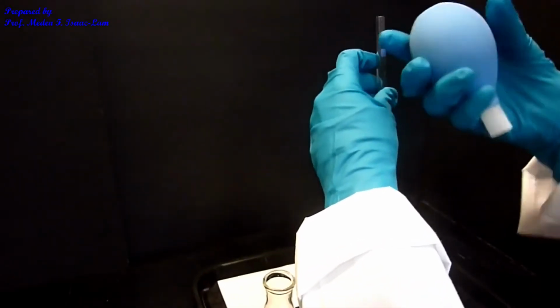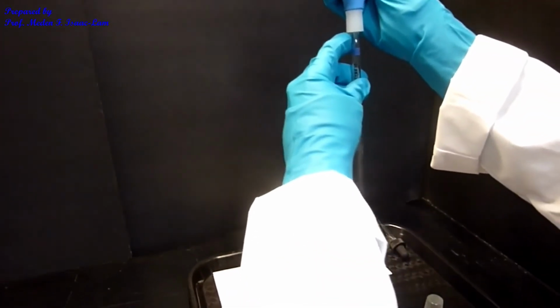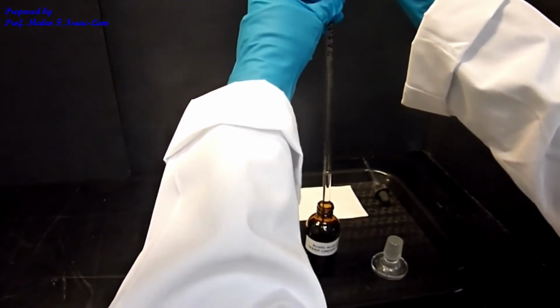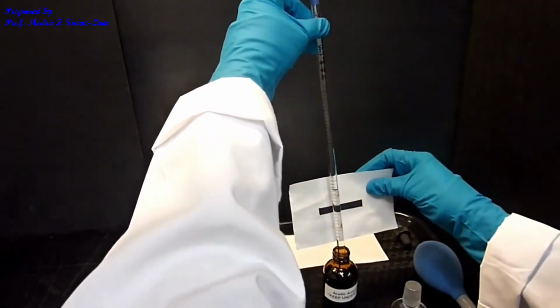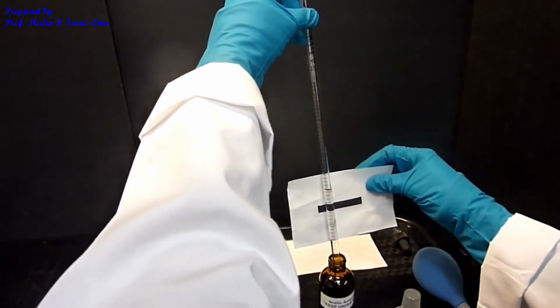So I'm going to be using the bulb, and I withdraw up to 3. So that's 3. And then I will go down to 4.4.